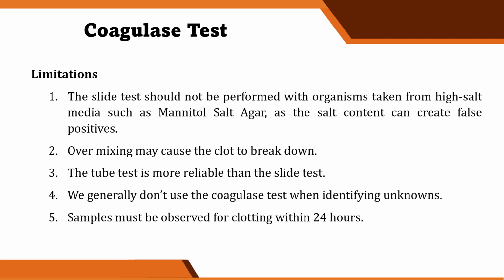So, overmixing naman may cause the clot to break down. Okay? So, dapat, hindi ma-over sa mix. The tube test is more reliable than the slide test. And then, we generally don't use the coagulase test when identifying unknowns. Okay? And then, samples must be observed for clotting within 24 hours.